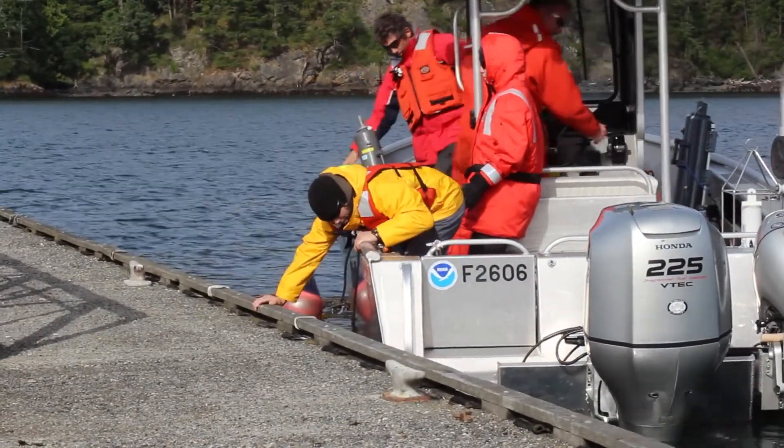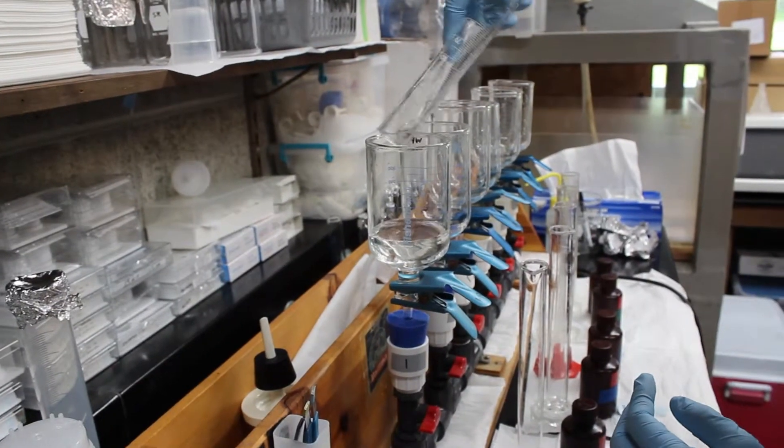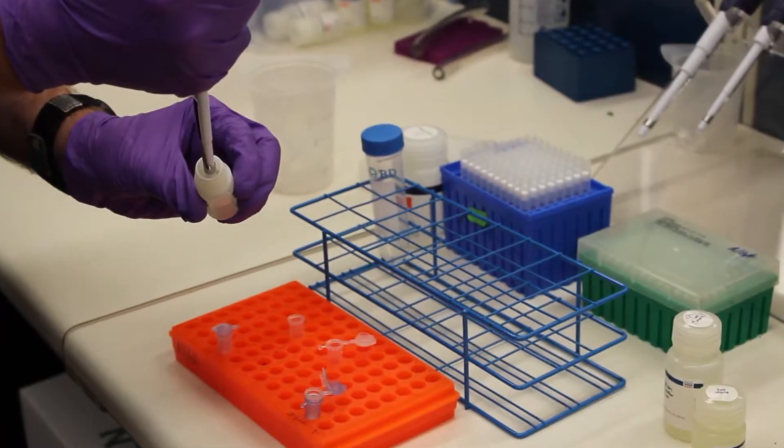The first thing we need to do is collect our samples. We'll take that water and either centrifuge it to collect a pellet of material in the bottom of a tube or jar, or we'll take a larger volume and filter it on a filter with pore sizes small enough to capture the heterosigma.